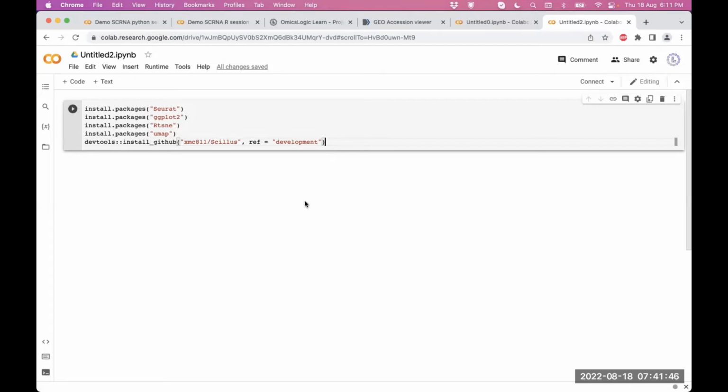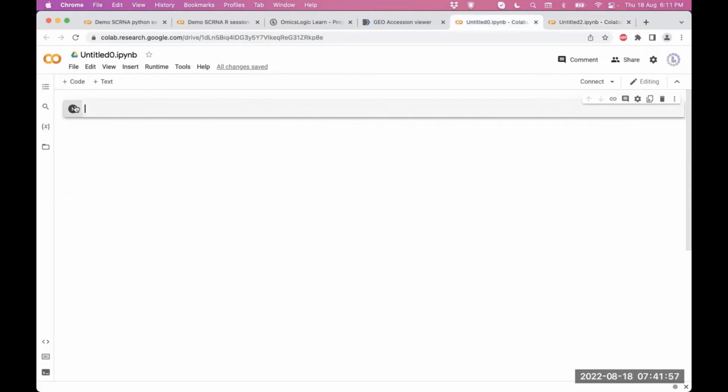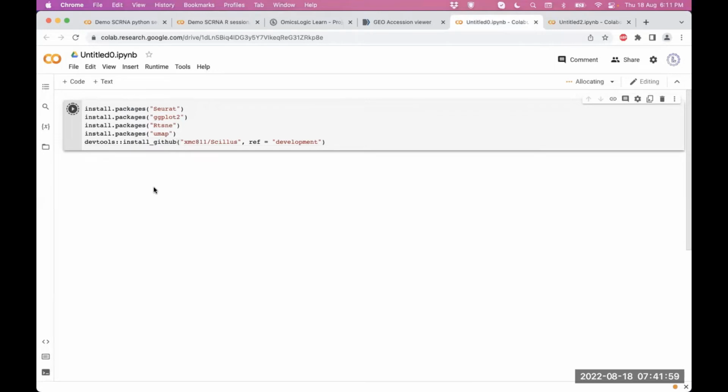And let me know if your installation is running smoothly. You just have to start it and it will install. If you get an error, for example, let it run. It will actually initialize before running. So connect and initialize before running.